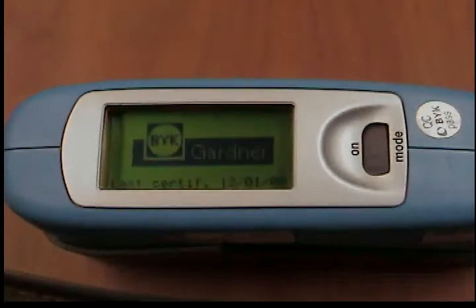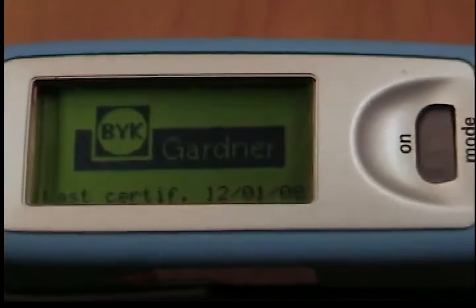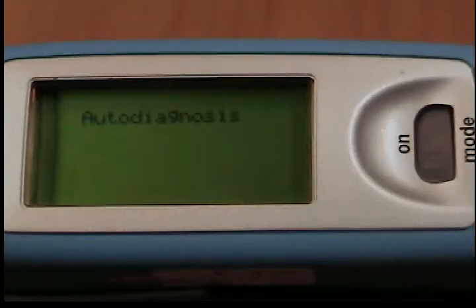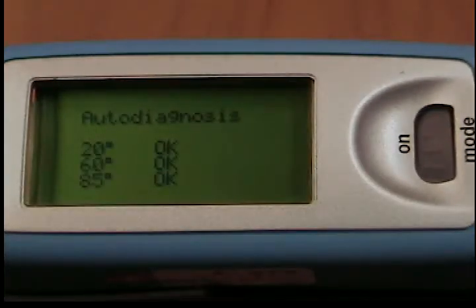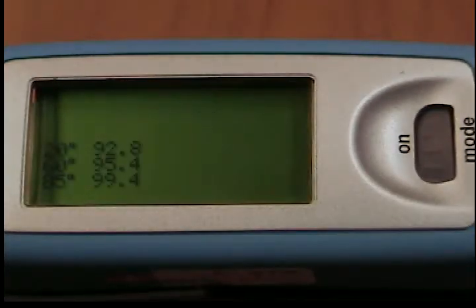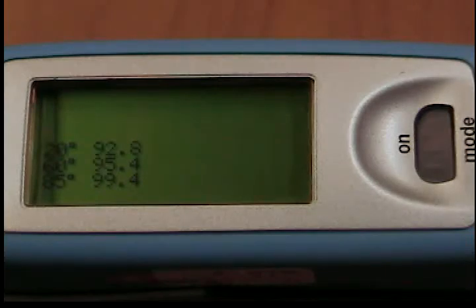Information on the date and last certification appears in the display. If the device was turned on in its holder, the auto-diagnosis test is performed. The unit then switches into the last measurement mode to be selected.